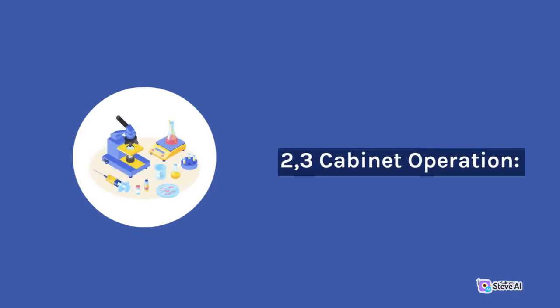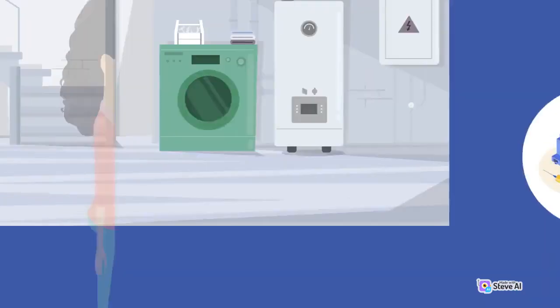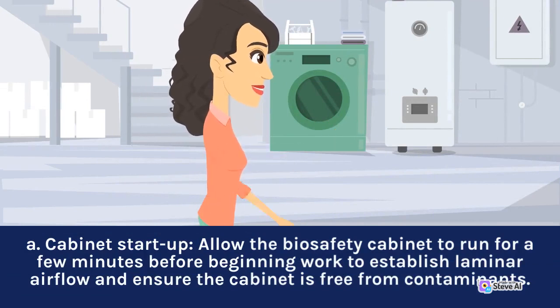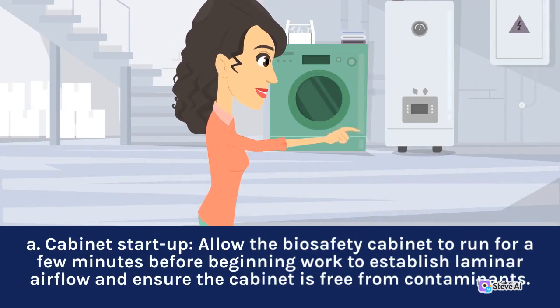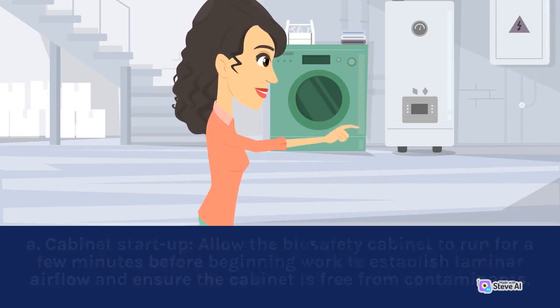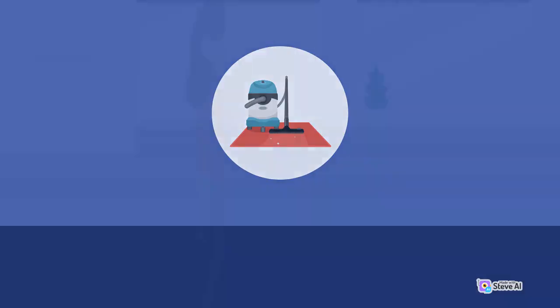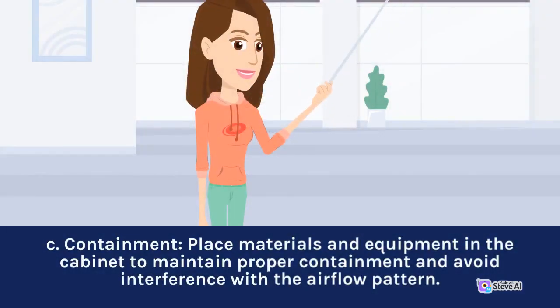Cabinet Operation. A. Cabinet Startup: Allow the biosafety cabinet to run for a few minutes before beginning work to establish laminar airflow and ensure the cabinet is free from contaminants. B. Avoid Blocking Vents: Keep the vents and grills of the biosafety cabinet clear of any obstruction, as this can disrupt proper airflow. C. Containment: Place materials and equipment in the cabinet to maintain proper containment and avoid interference with the airflow pattern.